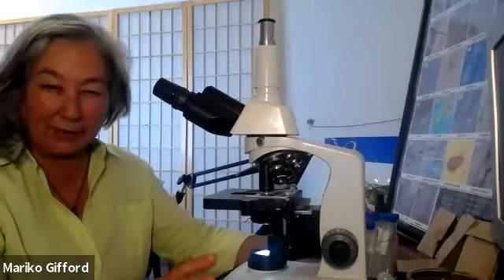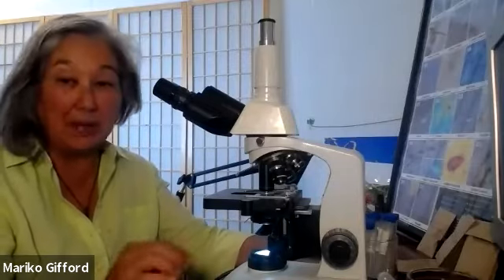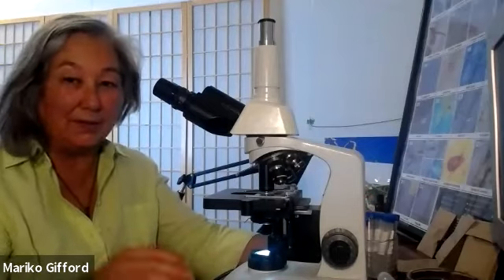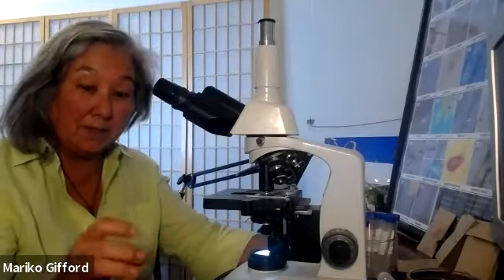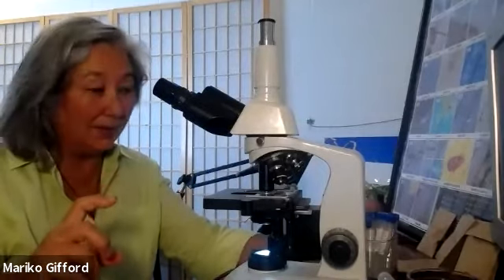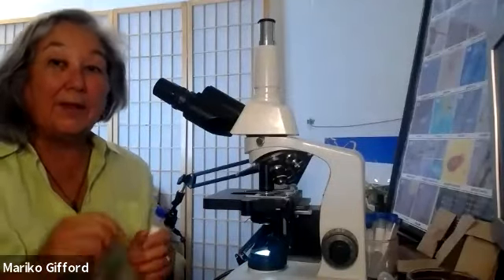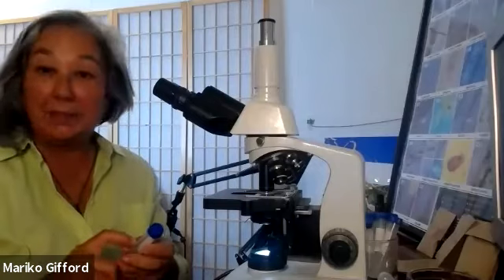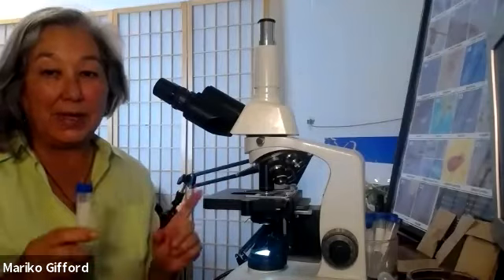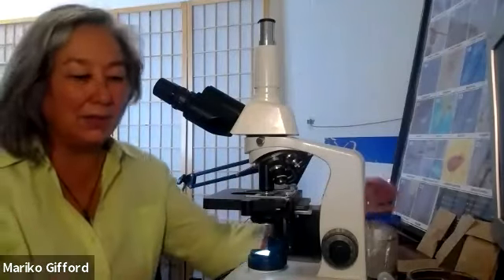Sometimes if there's a lot of aggregate in that sample, you have to dilute it again. And so you have to make note, because when you are doing a count, if you took 1 milliliter from that now 6 milliliter tube, then you're going to dilute it again by 5 or by 10. You have to keep track, because you're going to use that for making your end count. So this is all, as you get into it.